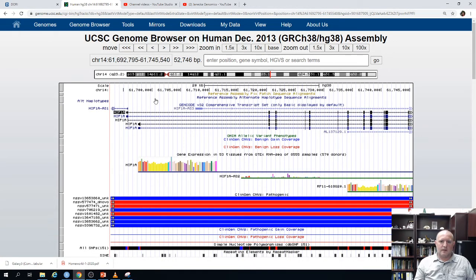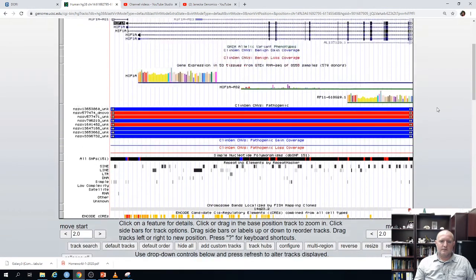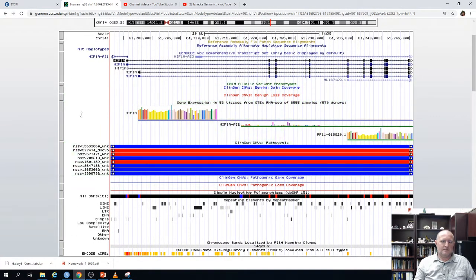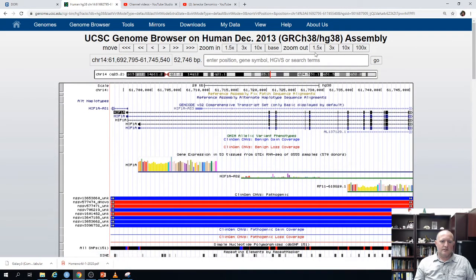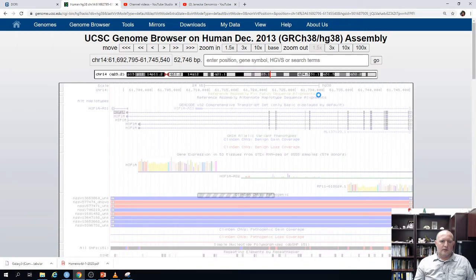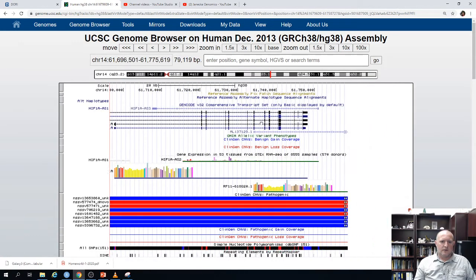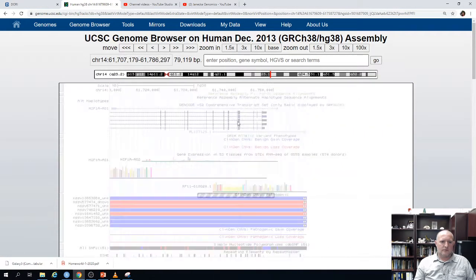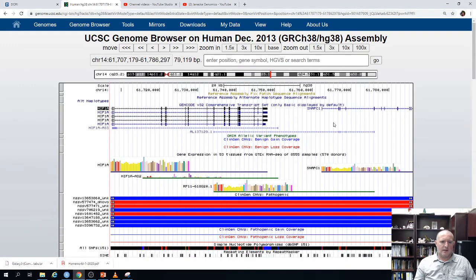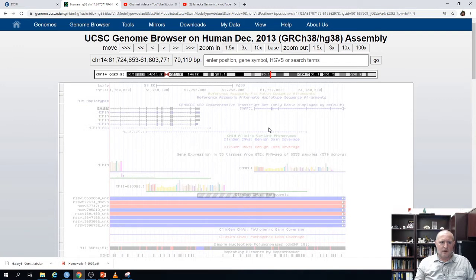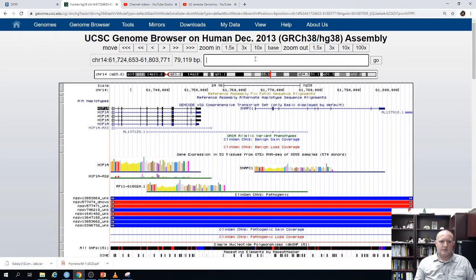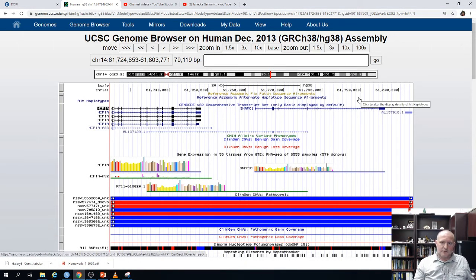So again, I just wanted to give you an overview of how the UCSC Genome Browser is organized, some tips, how you can move things around. You can zoom in and out, scroll with your mouse. If you ever lose track of where you are, just enter a gene symbol or chromosome position, and it will take you to that particular point. I hope you found this useful, and I will be posting more videos like this in the near future. Thank you.